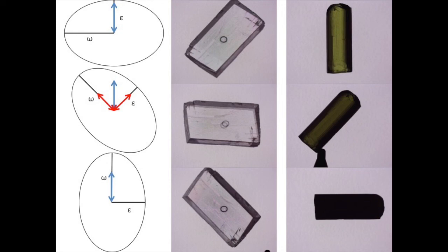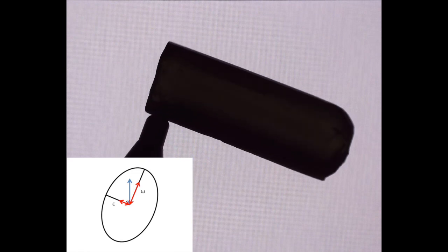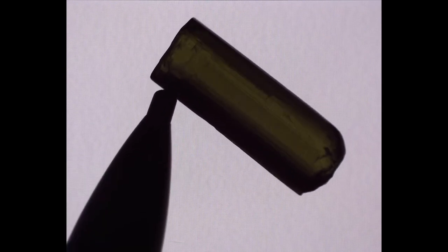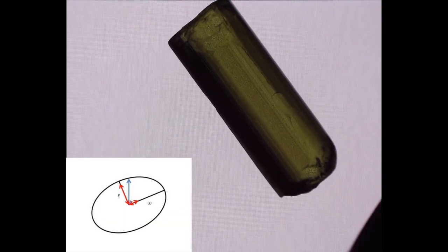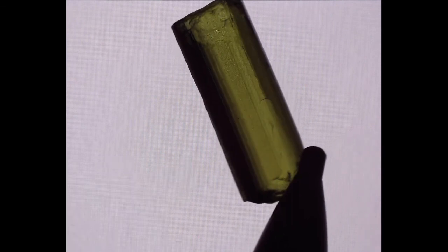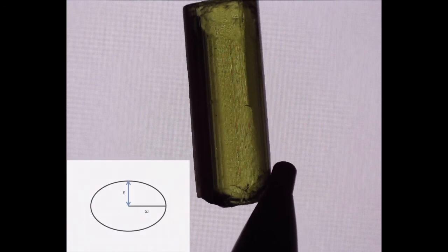Let's rotate the tourmaline in plane polarized light with a newfound respect for what's happening theoretically. Starting in a position where we see only the pleochroic color associated with refractive index omega, as the crystal slowly rotates the fraction of light associated with omega decreases and the fraction associated with epsilon increases. The color gradually lightens until the color associated with epsilon begins to dominate, and finally we see only light transmitted at epsilon.